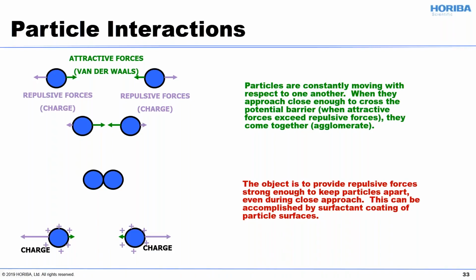And really the name of the game is I want to keep the particles far enough away that they don't touch. And once they touch, they say, hey, my surface area is lower, so I have lower energies touching. Okay. And so we accomplish this with surfactants.